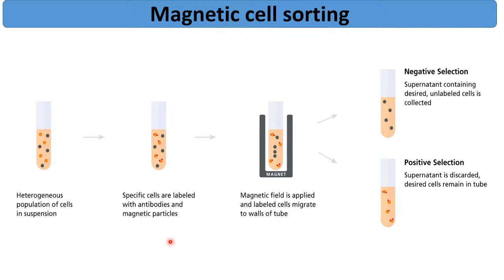So if I start the culture with overall cells, then what will happen? After some time, my cells of interest, which are CD4 T cells, will be lost. So my culture will be impure and will not be useful. So we can do the sorting of cells. One is by flow cytometry and the second is by magnetic cell sorting. In that, what we do, for example, we are putting PBMCs here in the test tube, and I am adding the antibody against the CD4 protein.